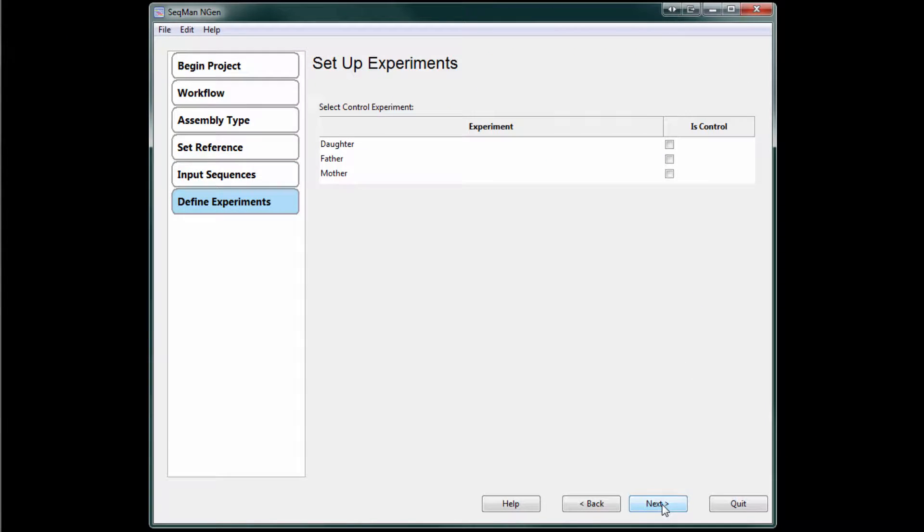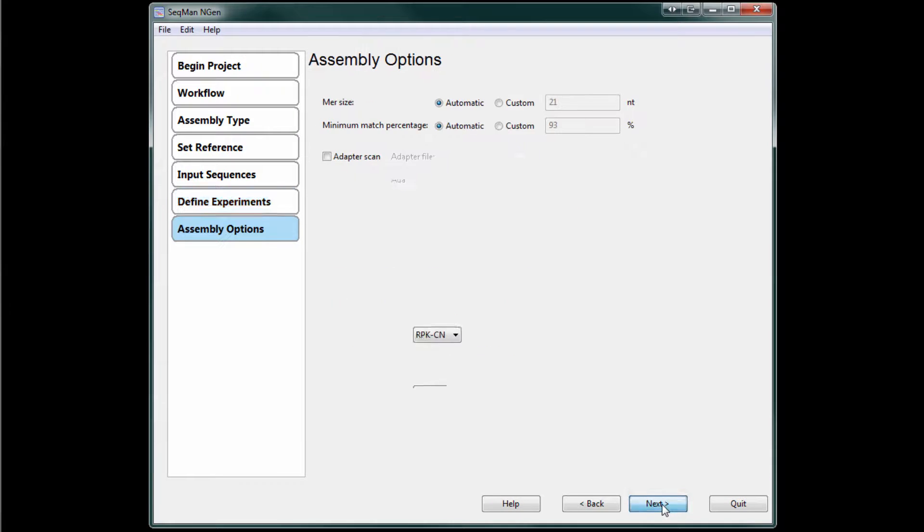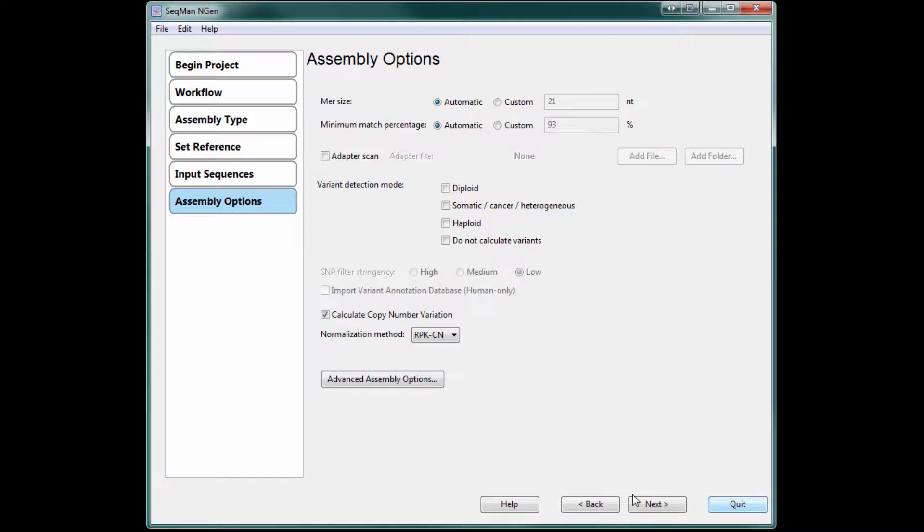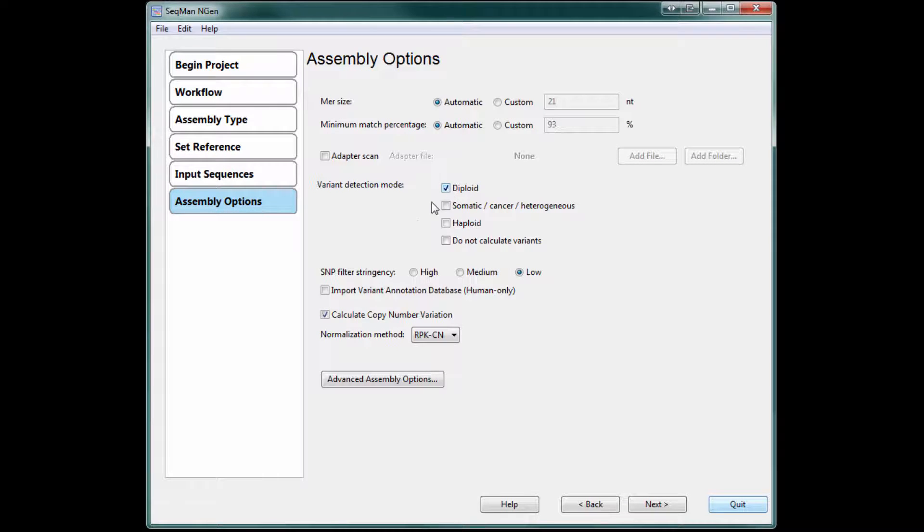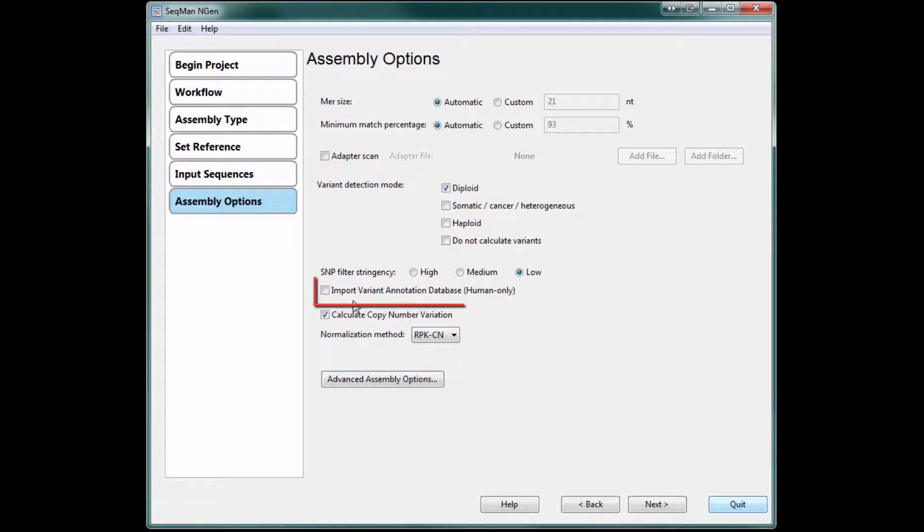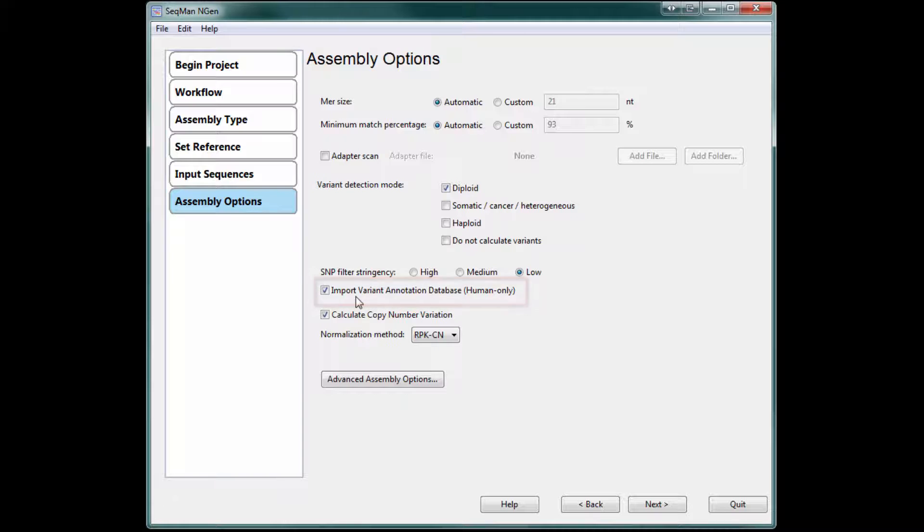Next, you have the option to set a control experiment. Then, on the Assembly Options page, I'll select Diploid Variant Detection. And because we're working with human data, I'm also going to import data from the Variant Annotation database. And note that by default, SeqMan NGen will also calculate copy number variation. We'll cover this in another video.